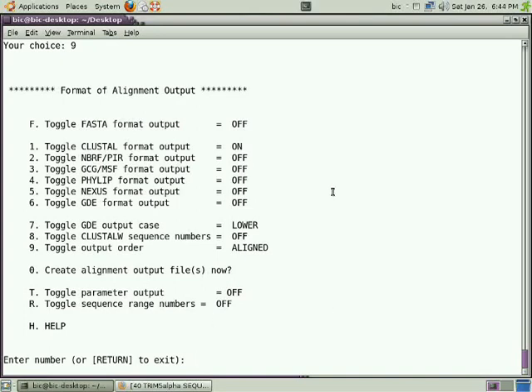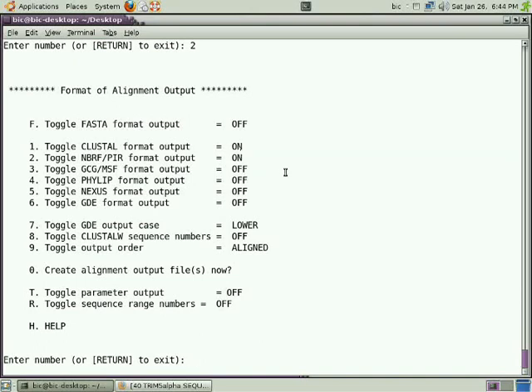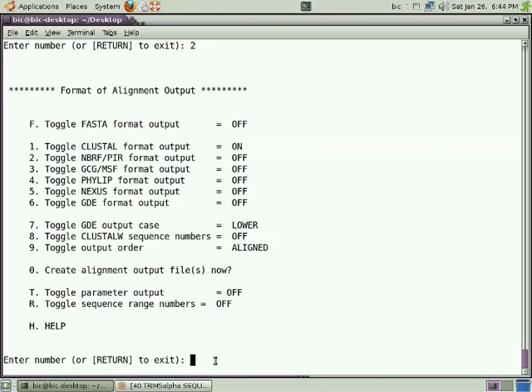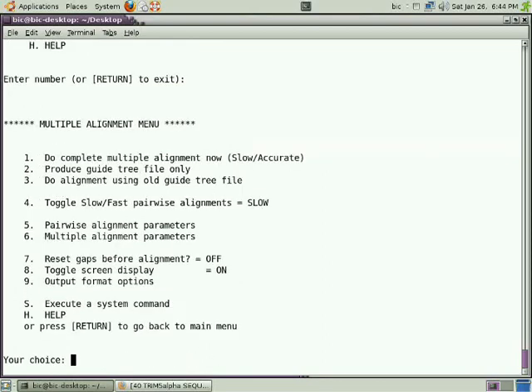For example, FASTA, ClustalW, PIR format, and other different formats. If I want PIR format, I should press 2 and press enter, so you may observe here PIR format is on. But I don't want that, I can again press 2 and turn it off. I want ClustalW format - that ALN format is often required as an output of MSA, so it's already there. We can return to our main options. Now everything is set.